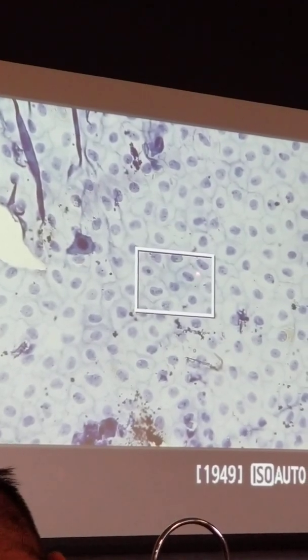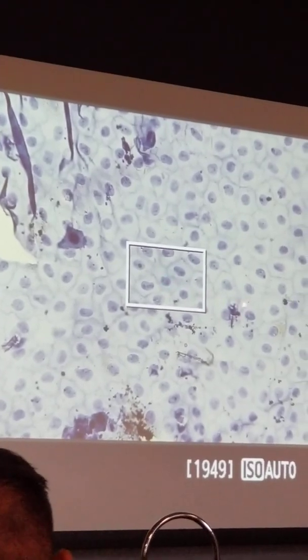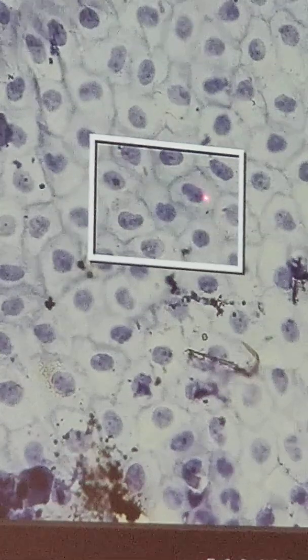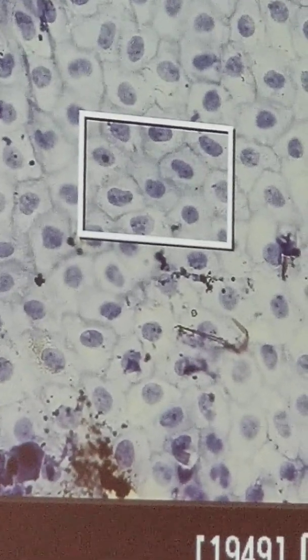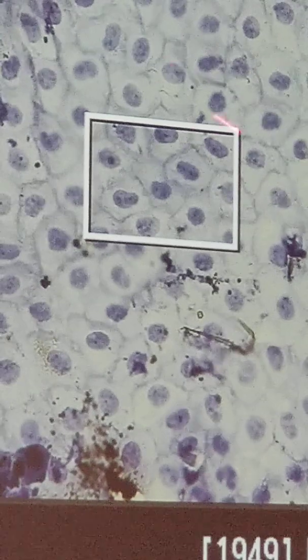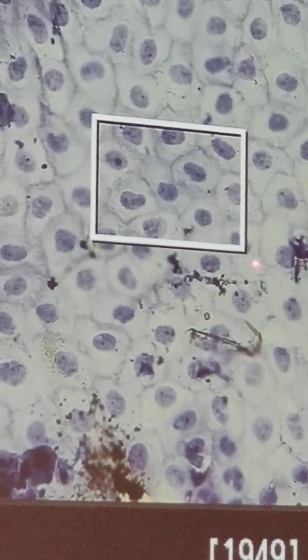So I'm going to look at this, there's my plasma membrane right there, right? So I draw 8 or 10, 12 cells right here. Nucleus right in the center, and right in here is the cytoplasm. Easy enough, right? So all I'm asking you to do is be nice and neat. Draw nice clean arrows and print your name nicely there, the name of the structure you're identifying.